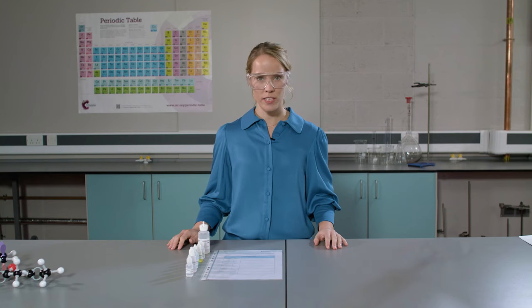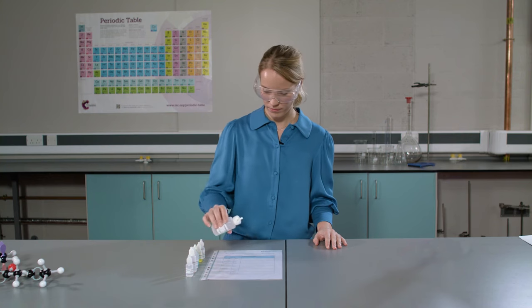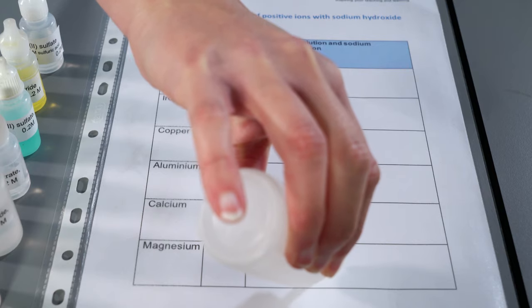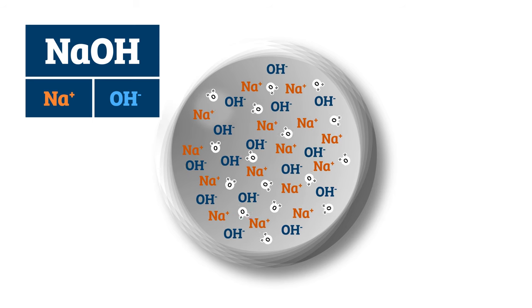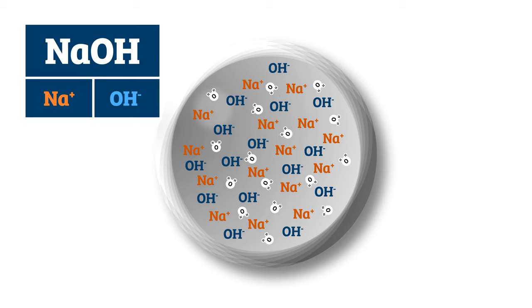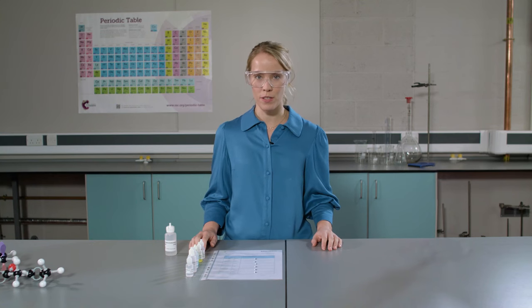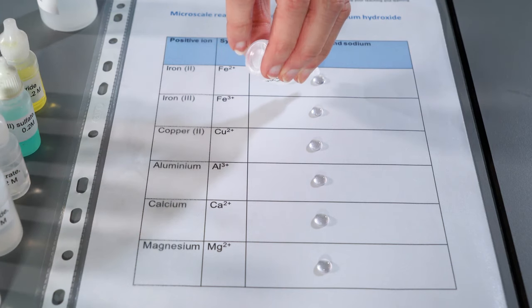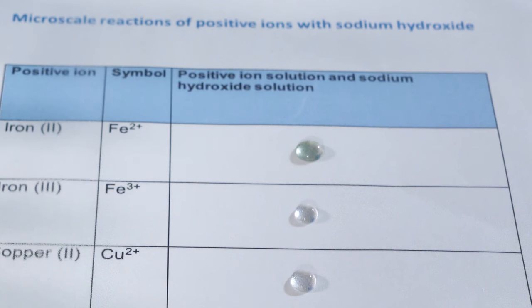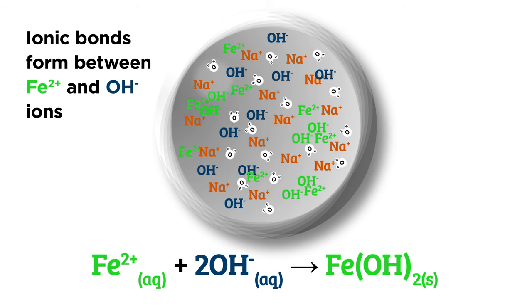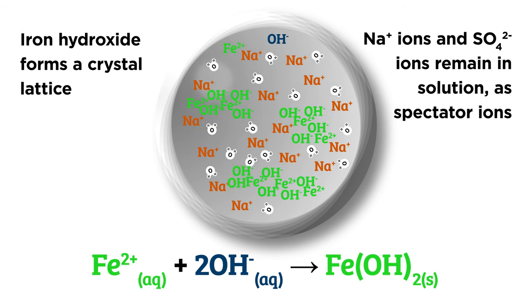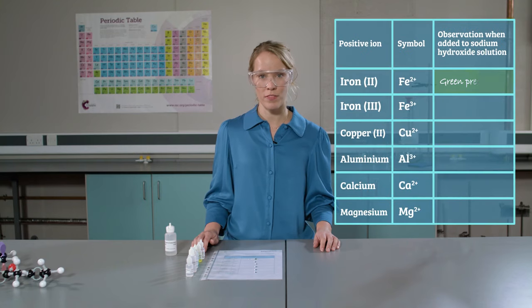First of all, I'm going to put my goggles on. Now I'm going to add two drops of sodium hydroxide to each box in the results table. Stay neat so that you don't get the results muddled. Before we add the positive ion solutions, think about which ions are present in the sodium hydroxide solution. Remember that in aqueous solutions, water molecules are also present, as well as the substance dissolved in it. Now we're going to add two drops of each positive ion solution onto the sodium hydroxide solution. Observe carefully and write down what you see. I'm going to start with iron(II) positive ions. I can see that a reaction has happened and a green precipitate has formed. An insoluble metal hydroxide has been formed — this green precipitate is iron hydroxide.